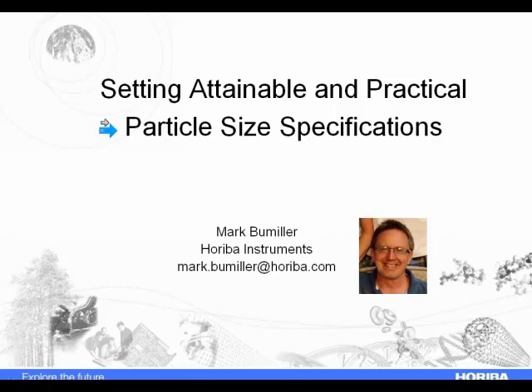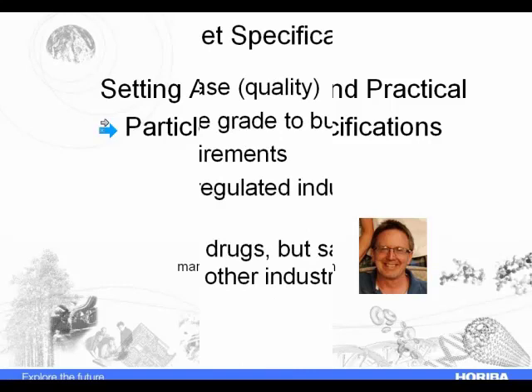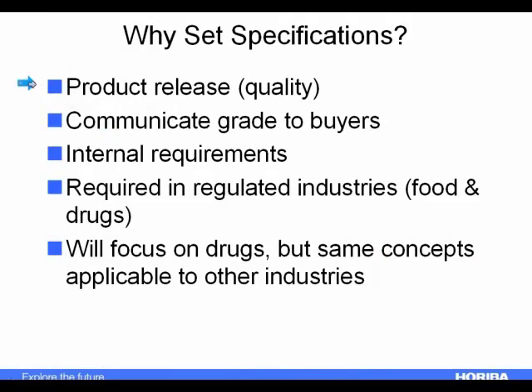So we're going to talk about setting particle size specifications today. This is probably a 35-minute talk, something along those lines. I'll give you a little background on what should be the driving force of your specifications, which shouldn't have anything to do with the instrument, but to do with the performance of your product. We'll talk about some of the techniques we might use for the measurements, and then some guidelines specific to each technique.